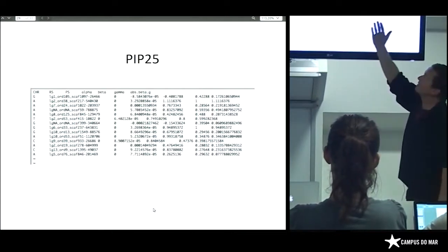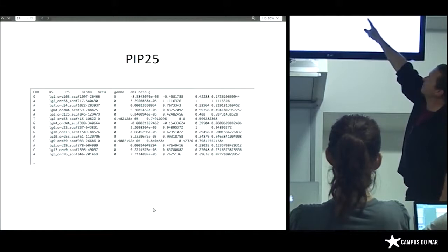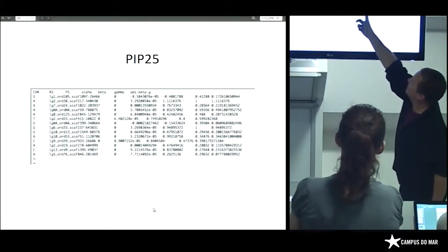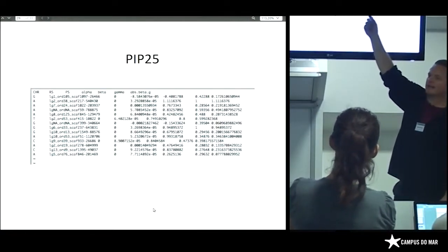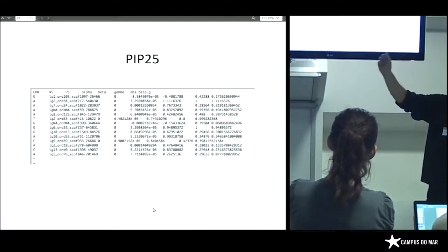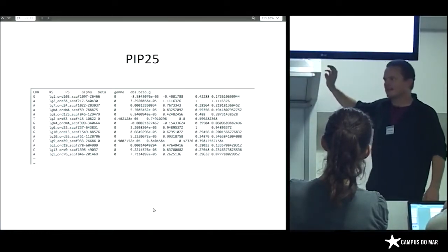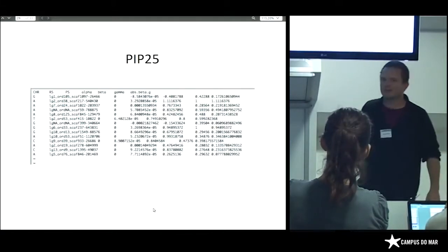But we get a list, and this second last column is the posterior inclusion probability. Look at this. We have 2 SNPs that in 100% of models, they're always there. That's saying that this SNP is real. But we have to remember that because our hyperparameters suggested we can explain so much with so few data, it's probably an artifact.